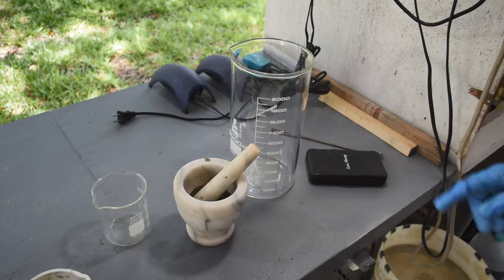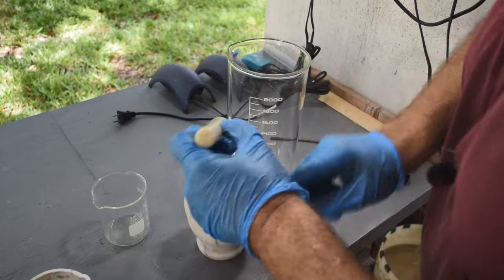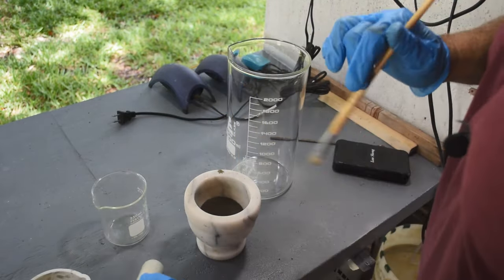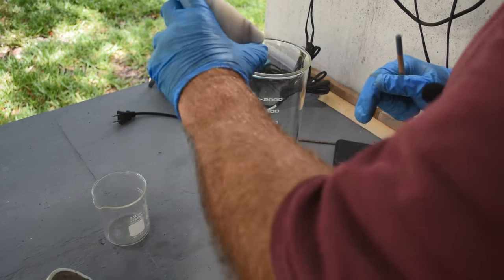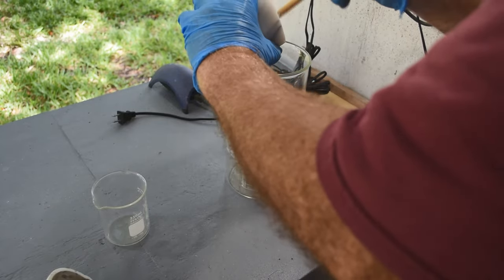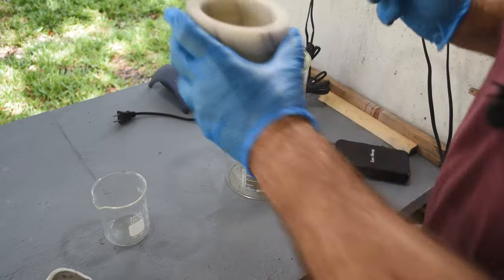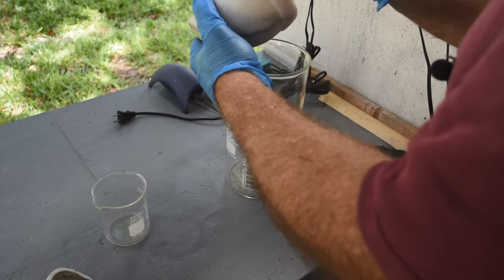I've got a two-liter tall-form beaker here. The reason I'm using a tall-form beaker is to help lessen - notice I said lessen, not eliminate - the chance of boilovers. I'm going to have to be careful here. Let me get all of this fine powder out of here.